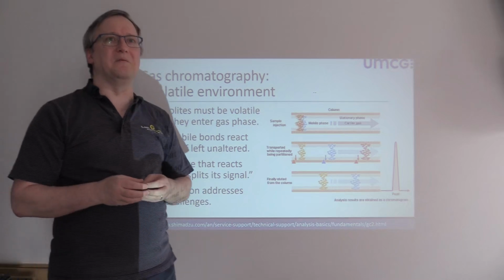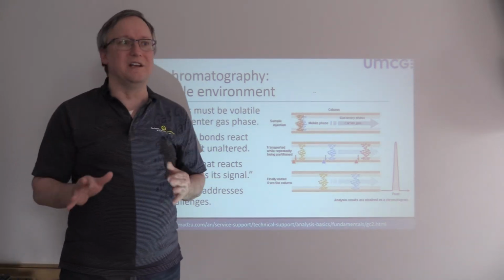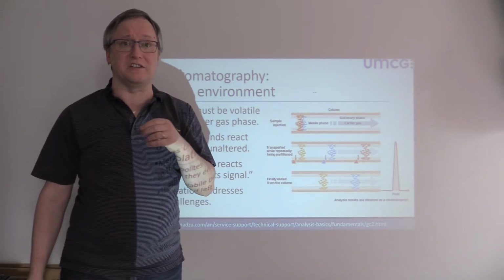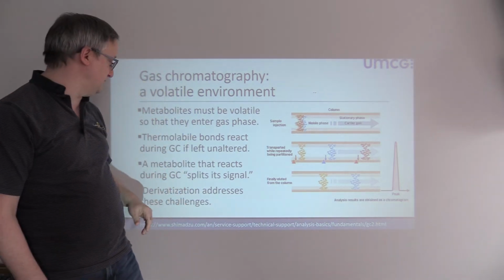Because naturally, 400 degrees is not an in vivo environment, right? This is not the temperature our bodies walk around at. So you could imagine at 400 degrees a lot of chemical reactions inside the molecule itself become possible.